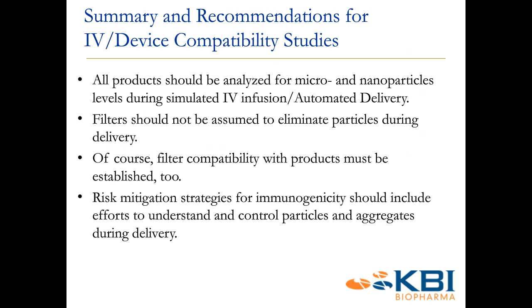Overall, again, one technique may not actually fully characterize your product post-administration. We do a lot of these studies, and very rarely do we just look at one single technique to help characterize particle profiles post any kind of infusion or delivery. Now, filters should not be assumed to eliminate all particles during delivery.